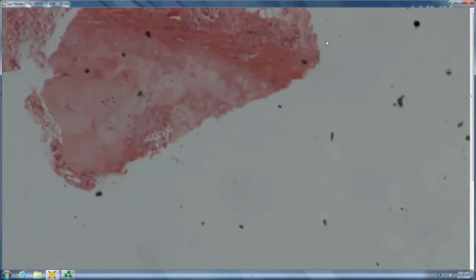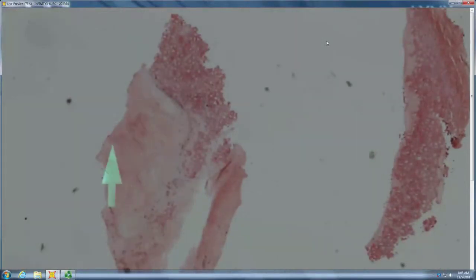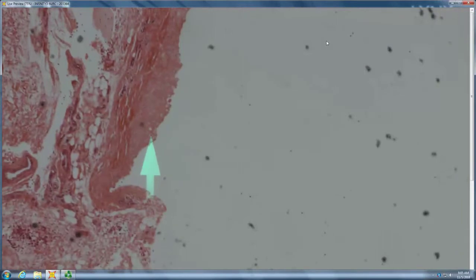Skin. Yes. And what's down here? Is that cartilage? Cartilage. Is it happy cartilage? No. It's unhappy cartilage, right? Yes. And it's unhappy and kind of degenerated down to jelly right in the middle. And here you're just seeing the top half of what should be cartilage, and then it kind of fell apart at the bottom.